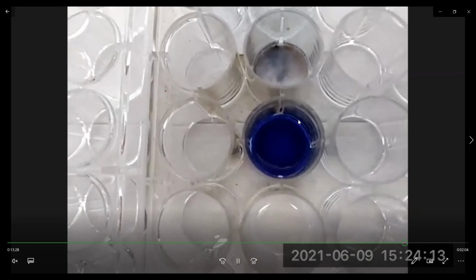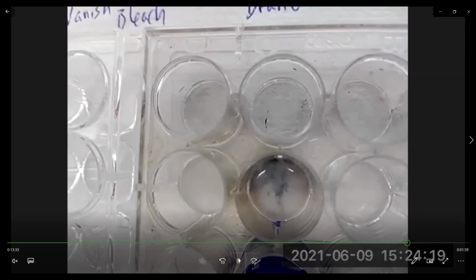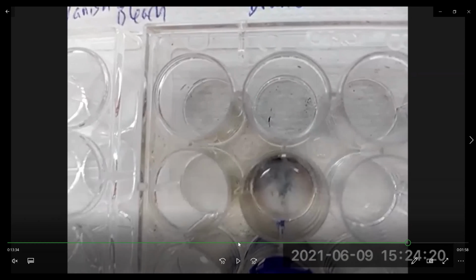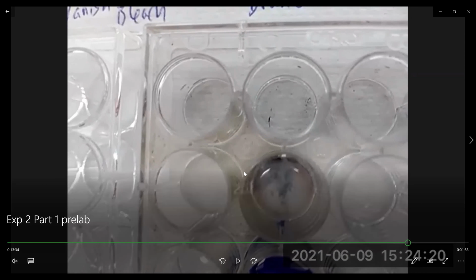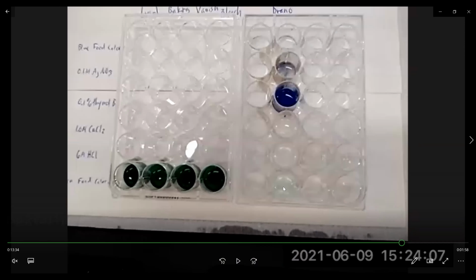So here you would just, and again, don't discard your cell well plates, give it a few minutes. Things that may not appear to be reacting right away may appear to be reacting after 5 or 10 minutes. So it's always good to wait and check later to see if a reaction is occurring or not. Likewise with the green food coloring, I would wait 5 to 10 minutes and see if the green color goes away when you add the food coloring to your household reagents.